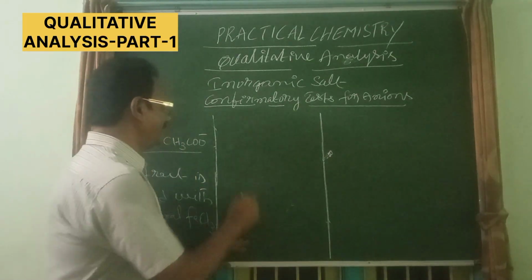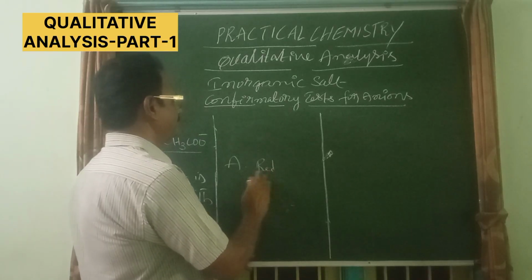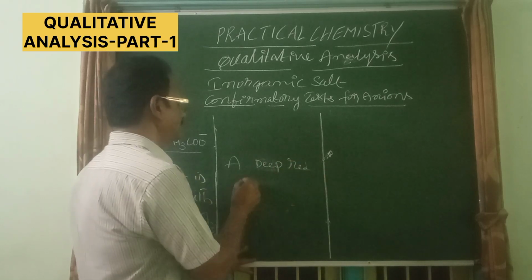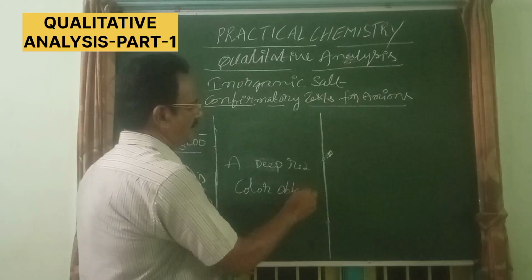Then a deep red color precipitate is obtained.